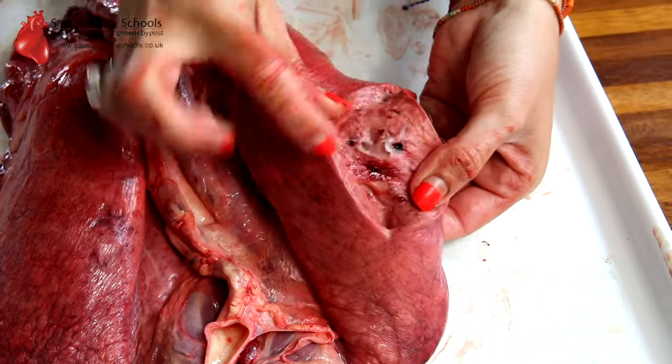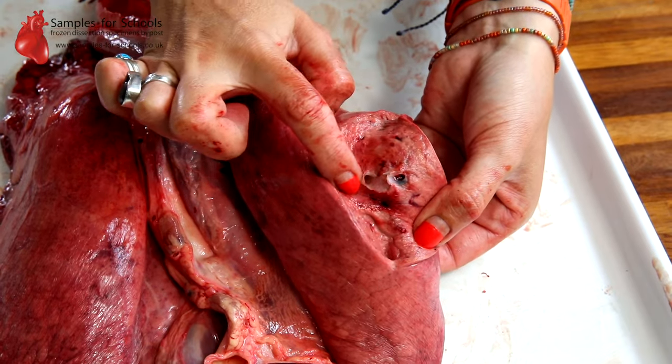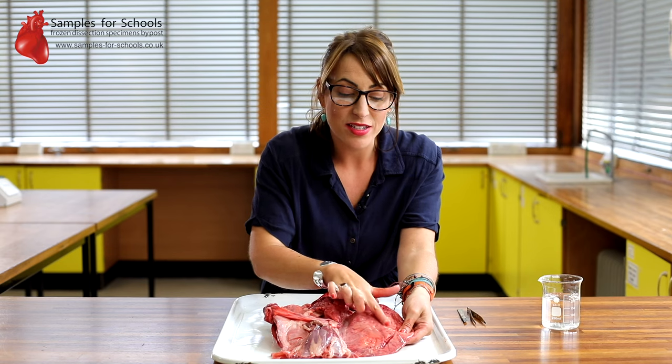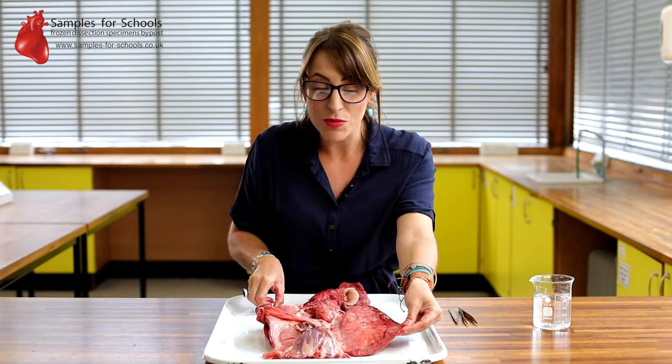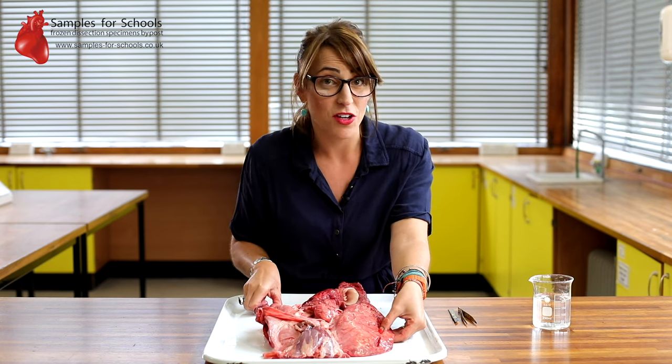And this is what we call the alveoli. They're the air sacs that fill up with gas as we breathe in. This is an incredibly specialised gas exchange surface. We're going to remove some of this lung lobe and see if it does still contain air. If it does, it will float in the water.